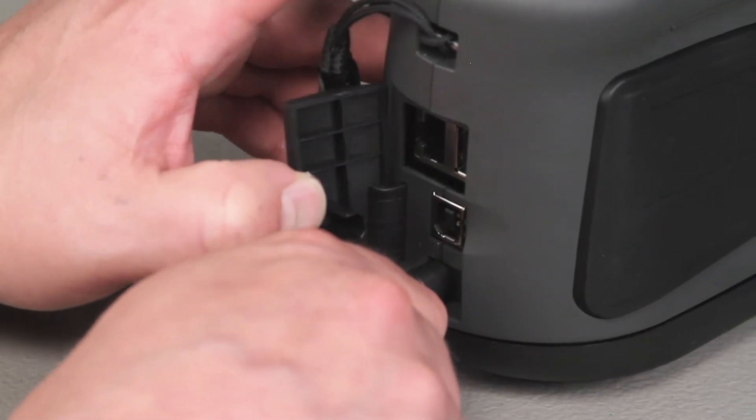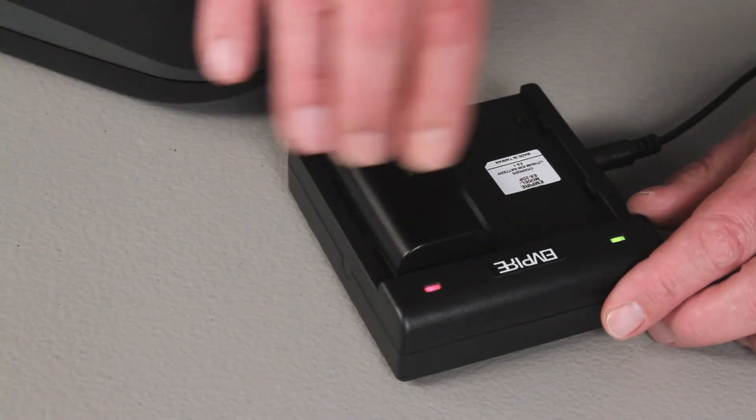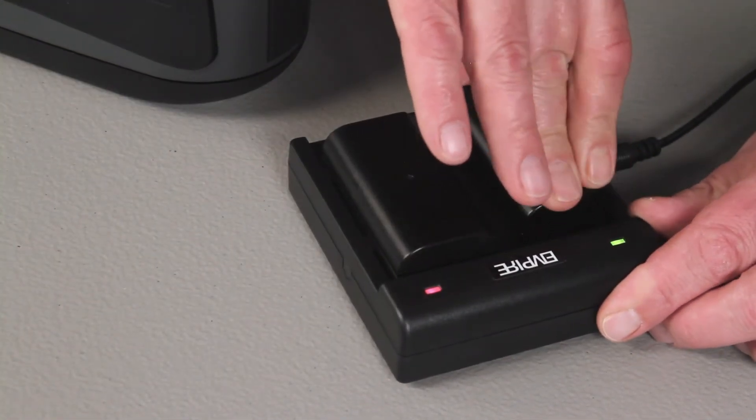The battery will charge when the instrument is connected to the power adapter. The separate charging station can also be used to charge up to two batteries at once.